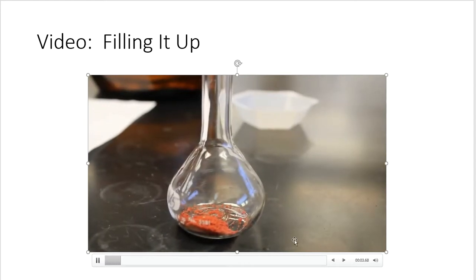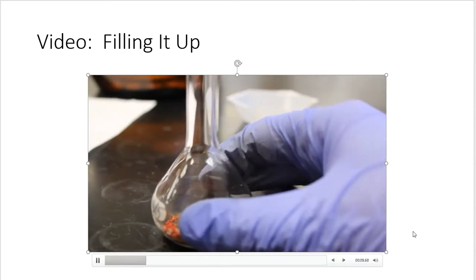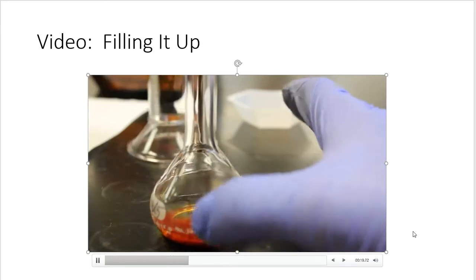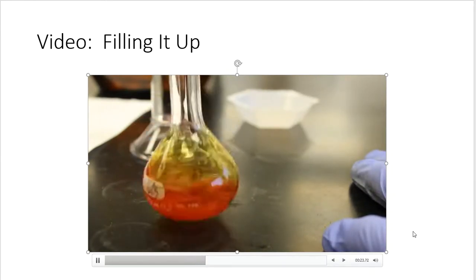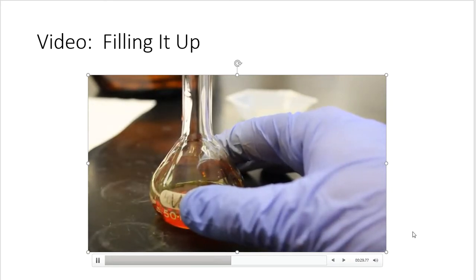So my crystals have transferred, and now I need to add ethanol, not water. It tells me an ethanolic solution, which means I need to be using ethanol as the solvent and not water from the faucet. All right, so I'm going to slowly pour in this ethanol. As I do, I'm going to pause just for a couple of seconds, give this a nice swirl, and that way you can see what color the solution is going to end up being. So I'm just going to slowly fill this volumetric flask up to the line.